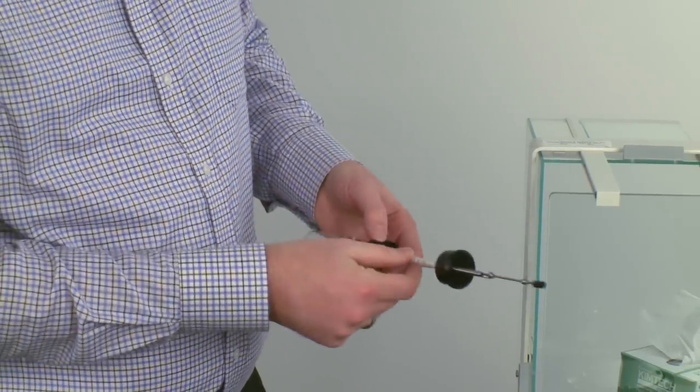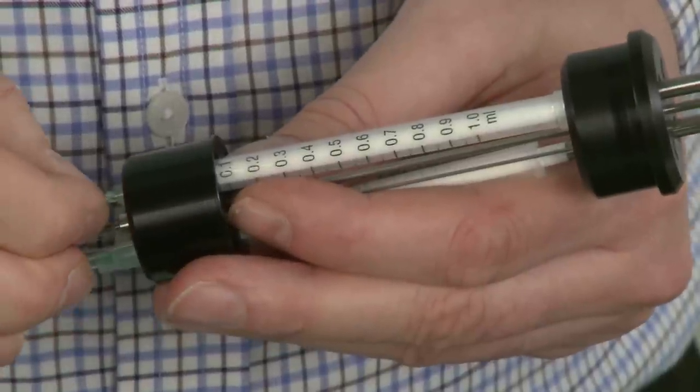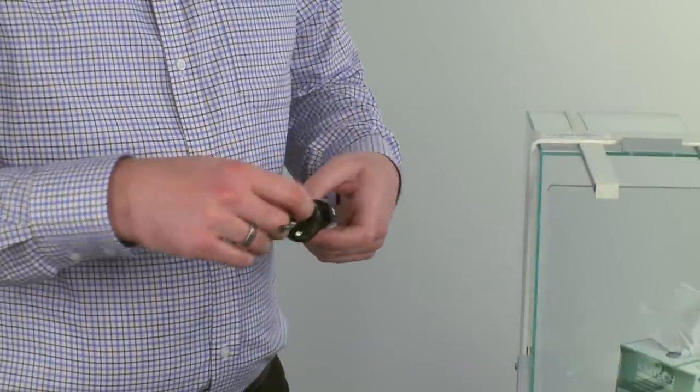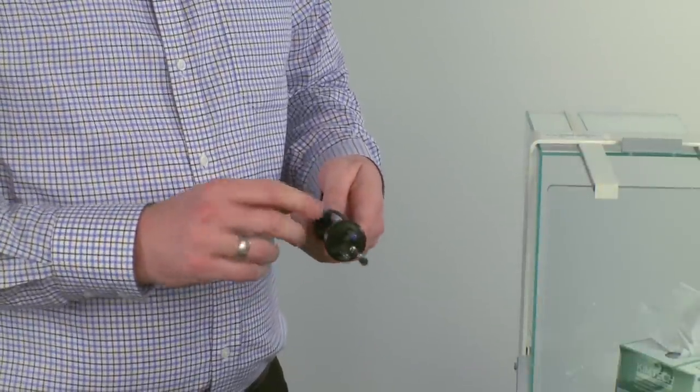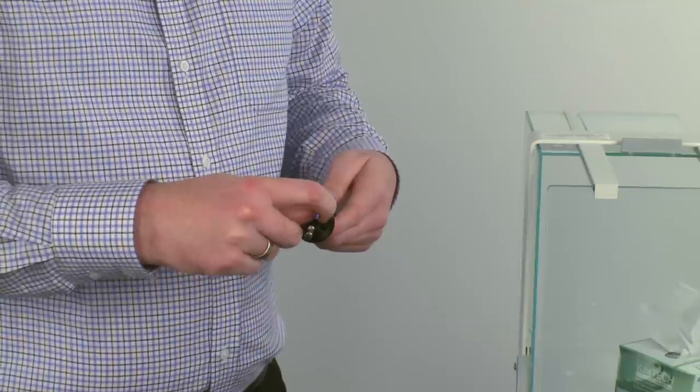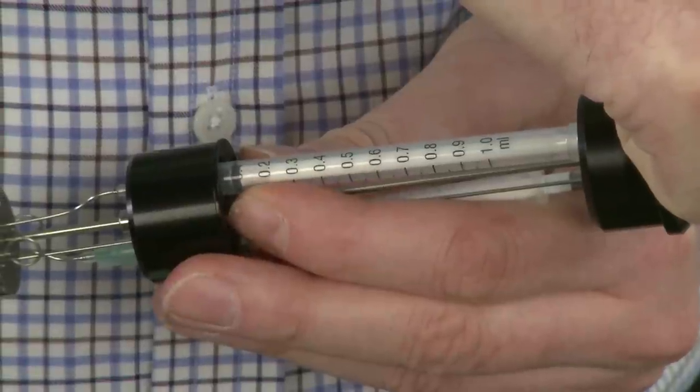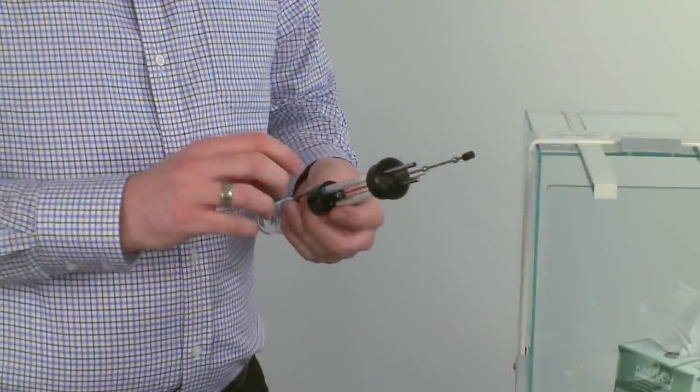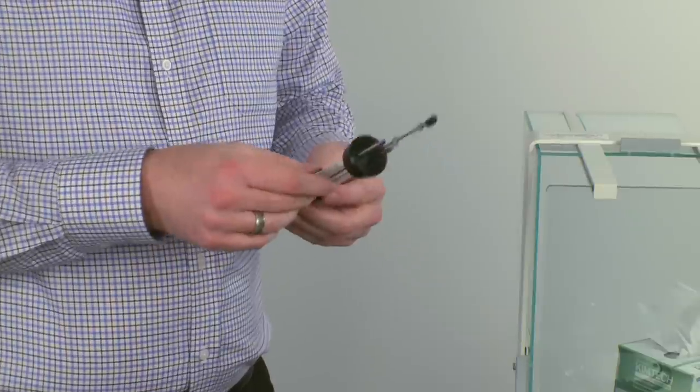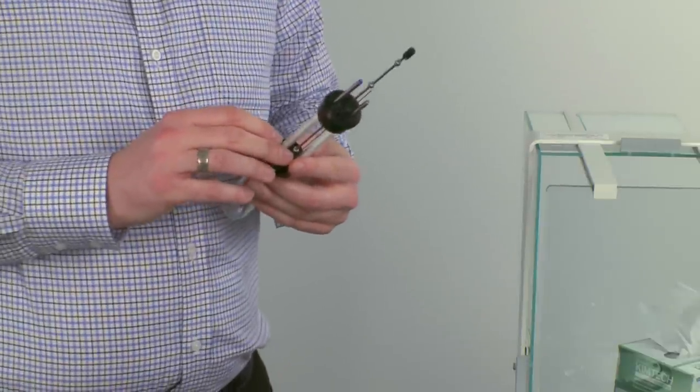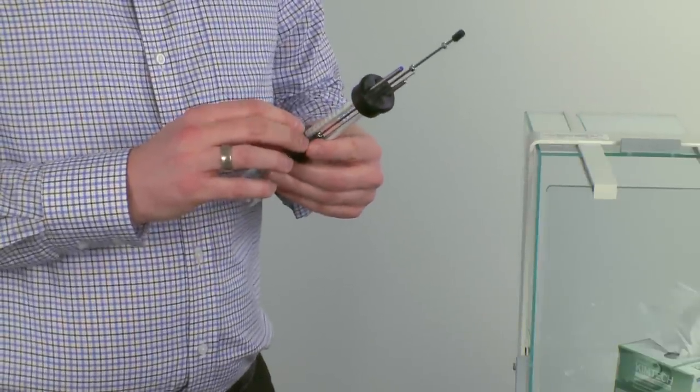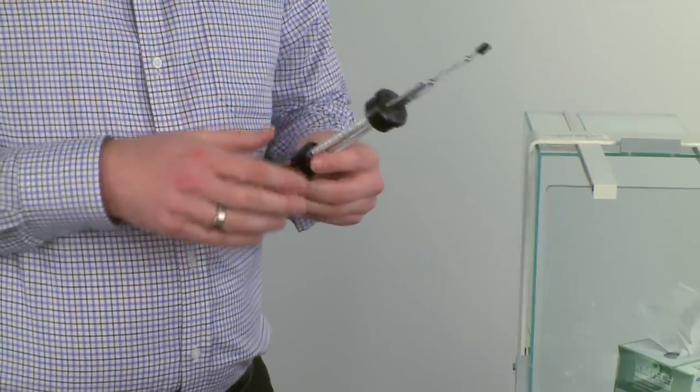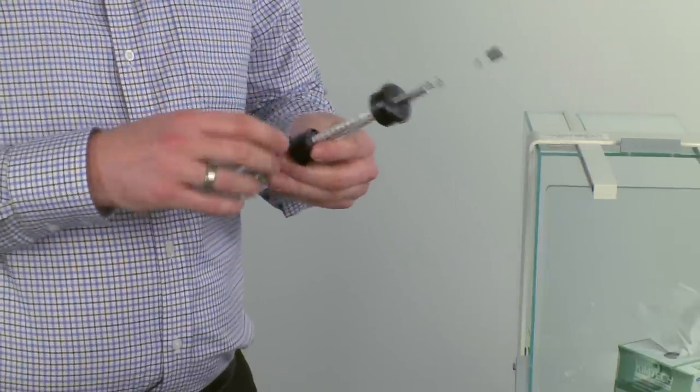Using the graduated scale of the syringe, move the plunger to the 100 microliter mark to create air space in front. This air space is important to ensure that everything you later load will be pushed inside the ampoule and nothing remains inside the cannula.